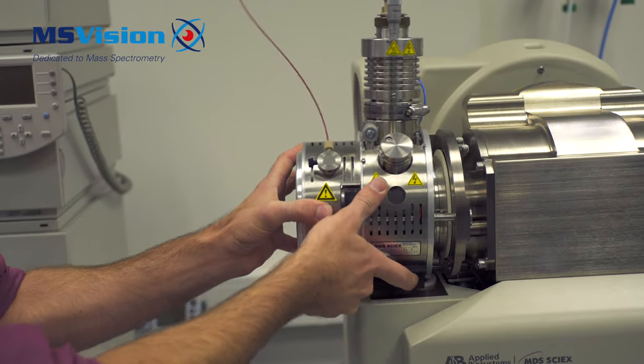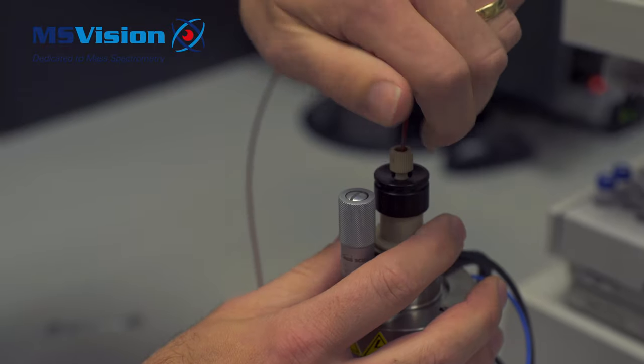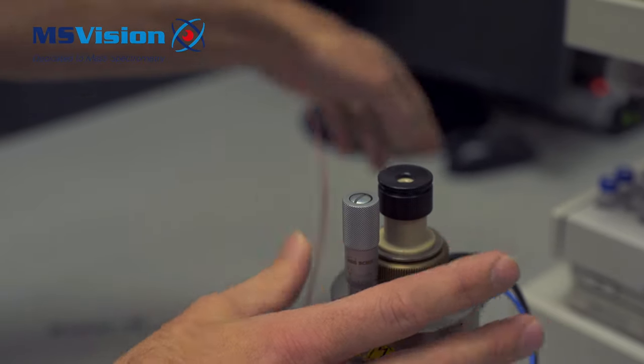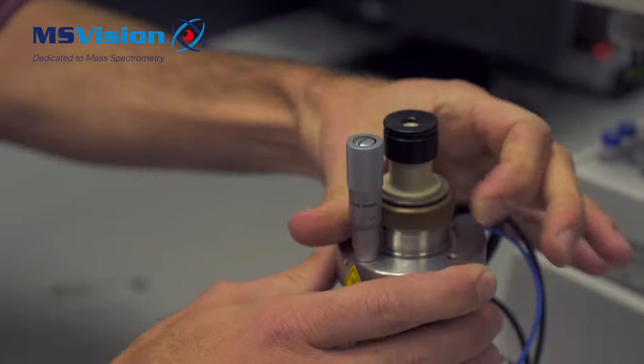Remove the source and HPLC tubing. Unscrew the brass nut to remove the ESI probe.